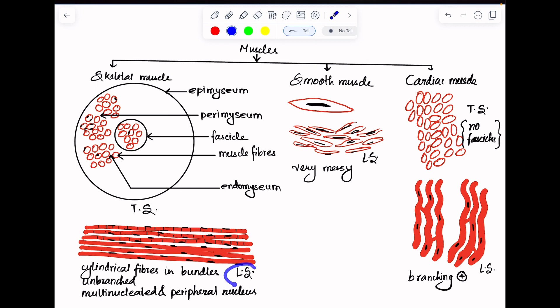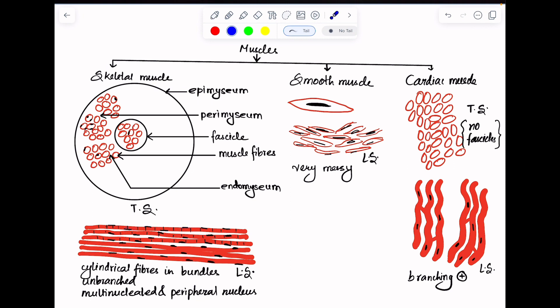Now, in the longitudinal section of skeletal muscle, you will be able to see cylindrical, unbranched, multi-nucleated skeletal muscle fibers where the nuclei are present at the periphery. They are unbranched and the nuclei are present at the periphery.